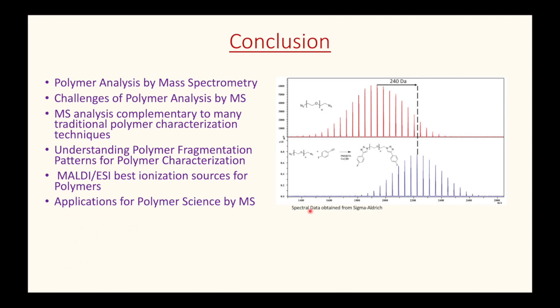And finally, a mass spectrum contains hidden data that we can use to connect the pieces. The differences between two spectral lines is the structure component that connects the fragments, and we put it together and really begin to understand the structure of the polymers, and that's one of the things that I think is so great about mass spectrometry. On top of that, we are able to extrapolate a lot of information. We can determine end groups, we can find polymer impurities, from processing operations, to researching synthetic polymers, to the development of new applications. That even includes drug discovery initiatives.